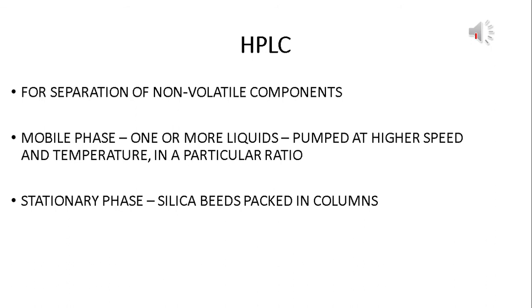And these liquids are pumped at a higher speed using a pump. And the stationary phase is packed in a column. But the length of the column is less compared with gas chromatography.